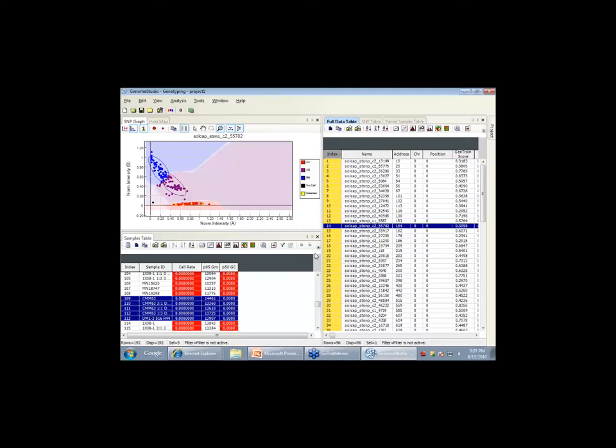So the question is, I expected to see the points in the center of the cluster. That's a comment. It's not perfect. If it was all perfect, you'd only see 5 points there with a bunch on top of each other, right? There's movement due to DNA samples and how well the assays work, and so on. That normalization has already been done. We're going with what the software is doing already, so you can't play with that normalization that I know of.